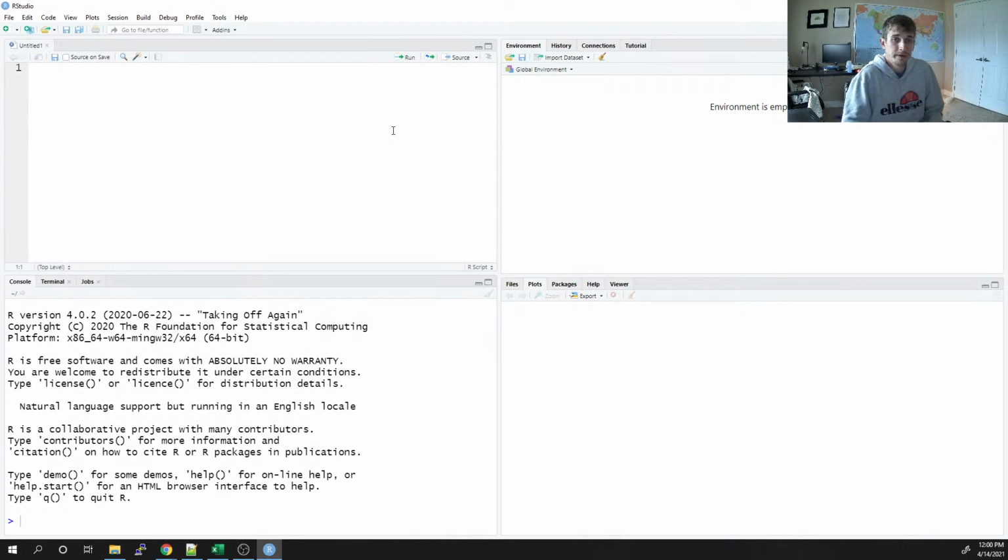All right. So, if you're in this class, you should have gotten your read count data, which is basically a matrixed version of our RSEM output. I pulled out the read count column from all of those files and just made a matrix of it. You'll see your sample name at the top and the gene name as a row name.